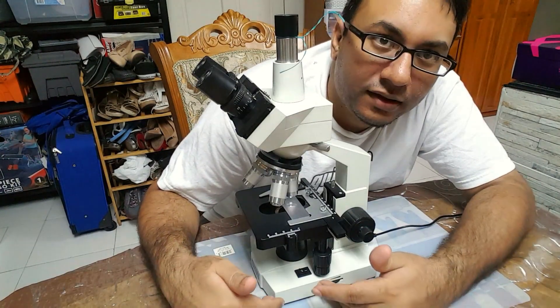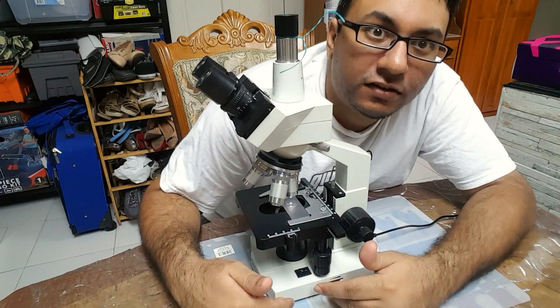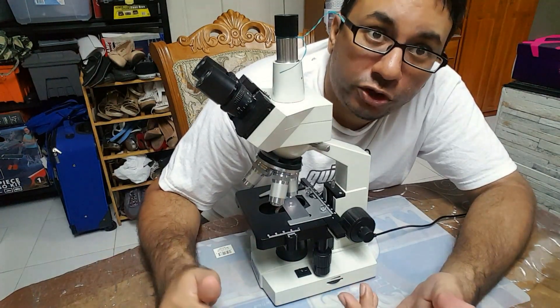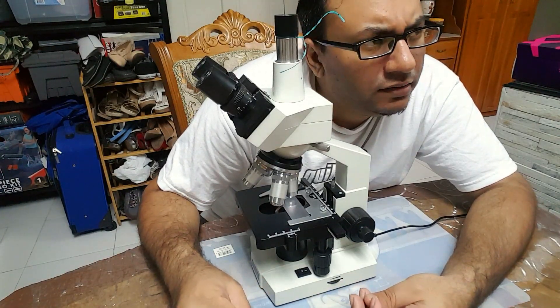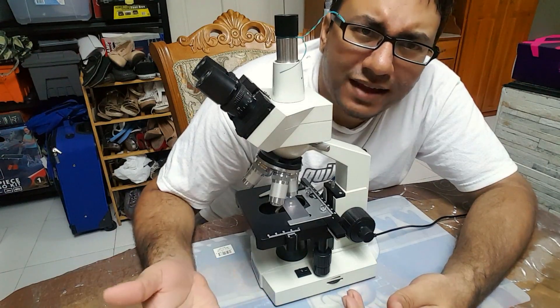With that being said, it's not a completely failed microscope. It is an excellent microscope that will give you 400x to 500x very easily. You'll be able to see things like leaves. I tested it on blood, though it wasn't as detailed as I had hoped.